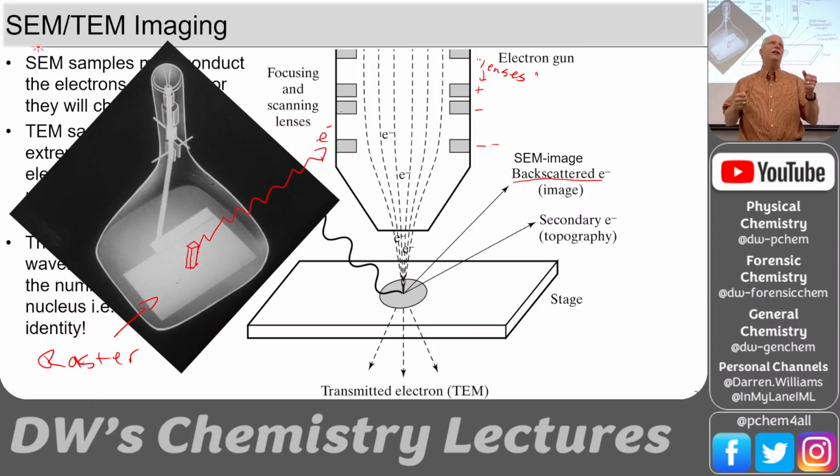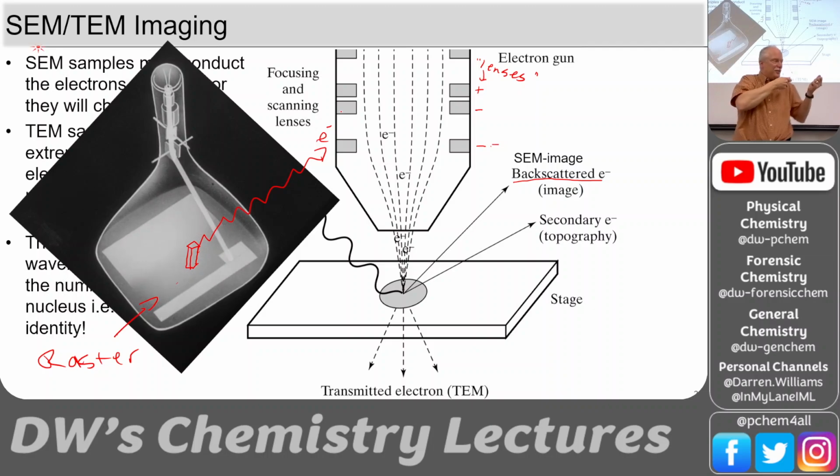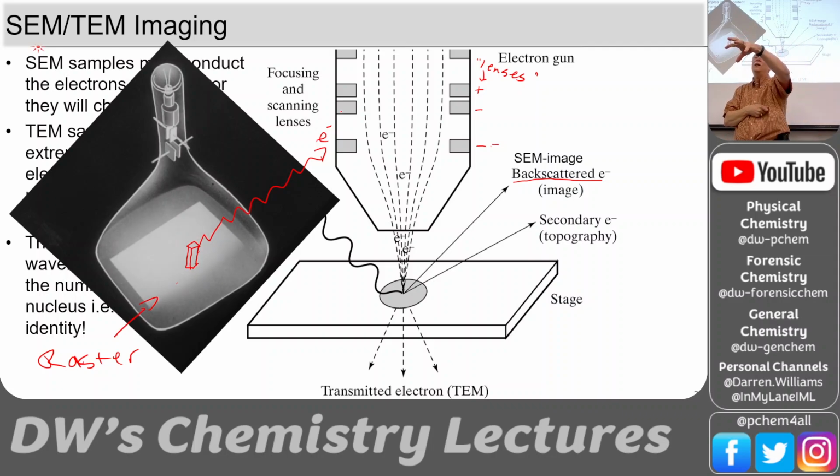I always want to do this with a pressure washer and a bucket of water or something like that. You spray the pressure washer along, and the water that bounces off the surface ends up in the bucket or not. And if you could measure how much water gets in the bucket and plot that versus coordinate, you would do this exact same thing. So we are just pressure washing the surface with electrons in a pattern and keeping track of where we're spraying.